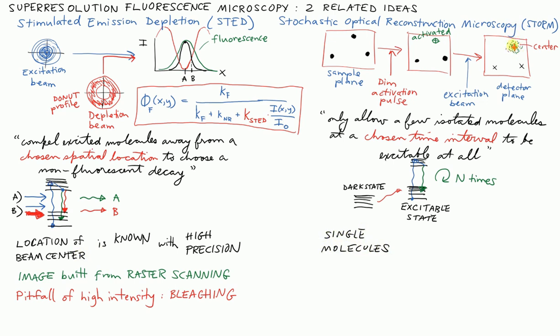We have only a single molecule emitting light, and we're able to tell where it is more accurately than we can squeeze a focused beam of light down to. We can get its center very accurately. So the answer is that single molecules, in this case, are assigned through the data to XY locations, and that's what's done with high precision.